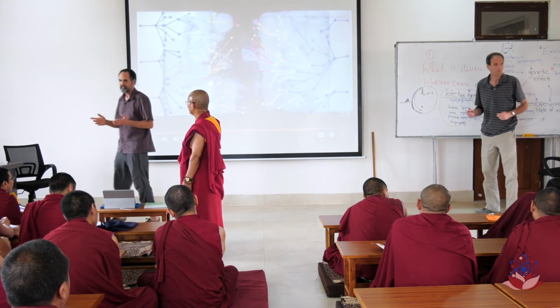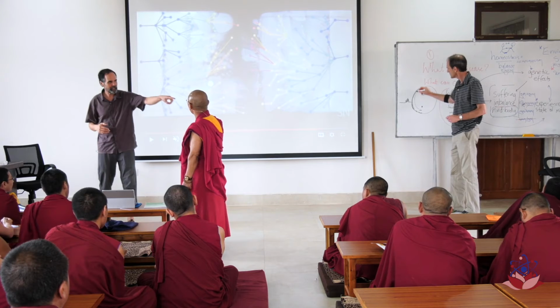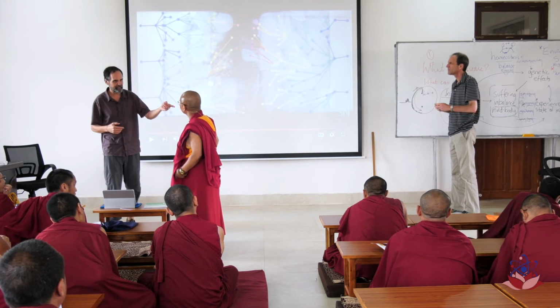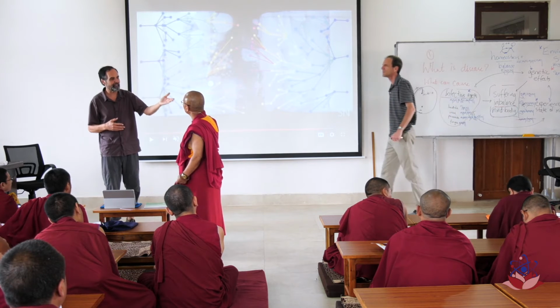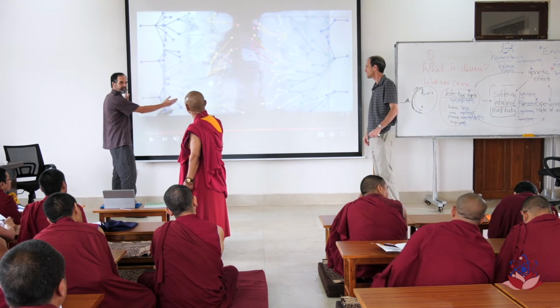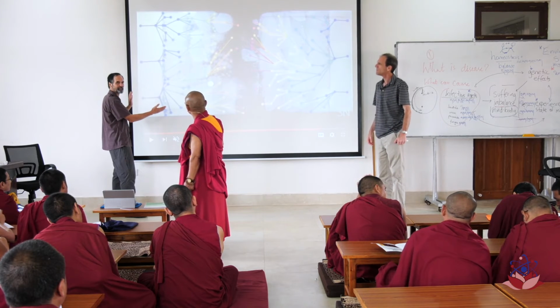Okay? All right. So, we've interpreted that plate. We're interpreting the natural history of that plate, how it came to look in that manner.